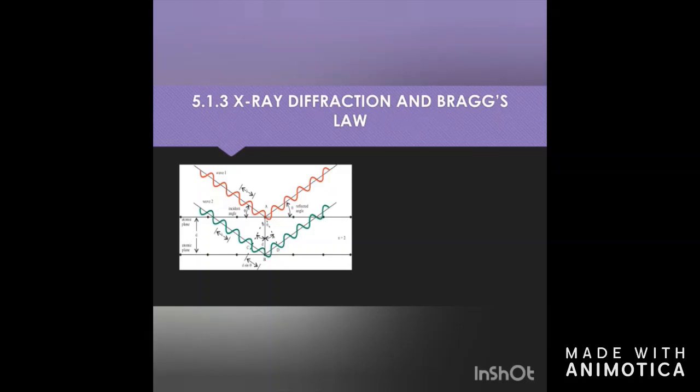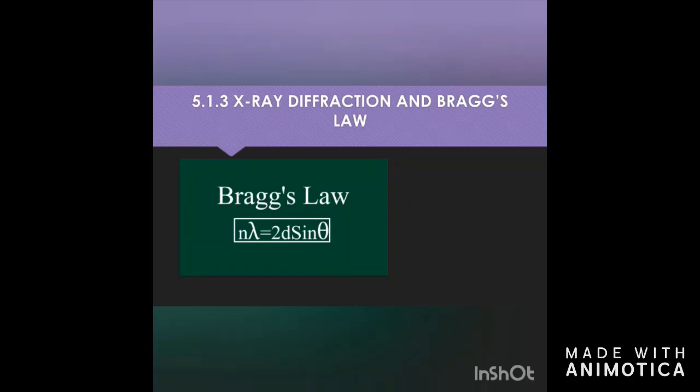The beam diffraction only takes place in specific directions. By measuring the direction of the diffraction and the corresponding intensities, one obtains information concerning the crystal structure responsible for diffraction. Bragg's law identifies the angles of the incident radiation relative to the lattice planes for which diffraction peaks occur. Bragg derived the condition of constructive interference of X-rays scattered from a set of parallel lattice planes. This is Bragg's law.